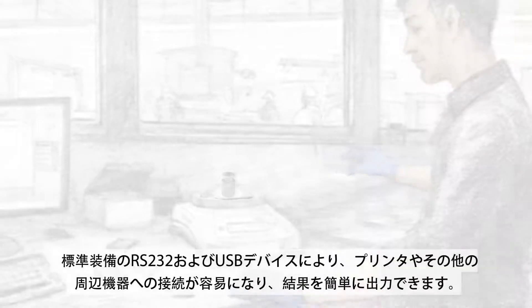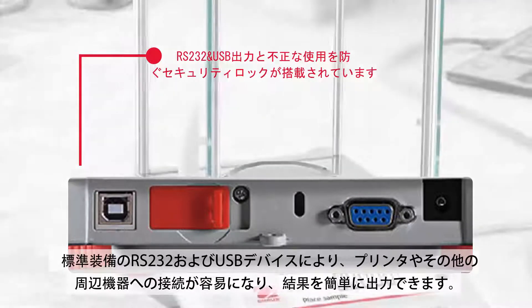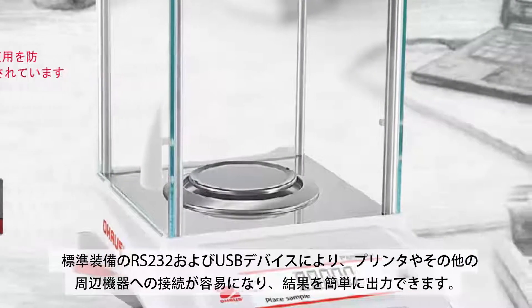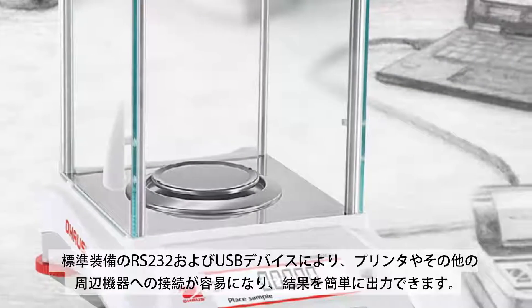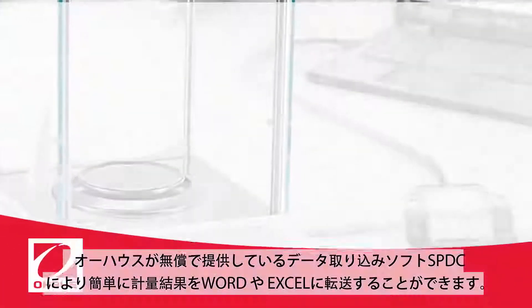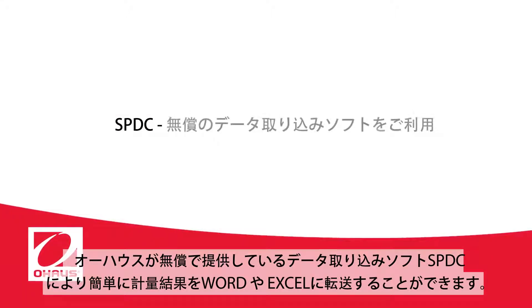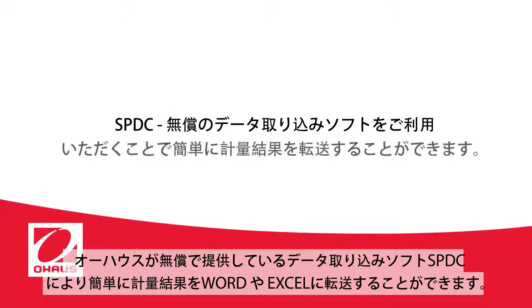Standard RS-232 and USB device ports allow for easy connectivity to printers and other peripherals, allowing convenient capture of results. OHAUS's free data collection tool SPDC provides a simple solution to import this data directly in common formats from a variety of applications.